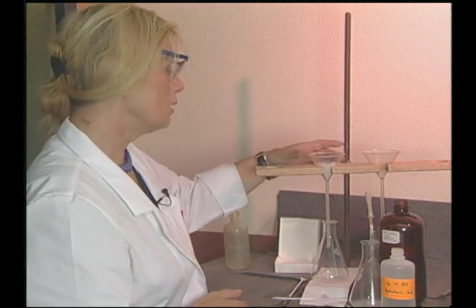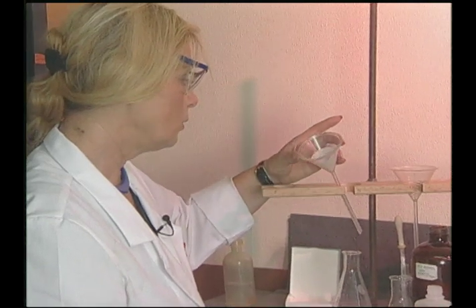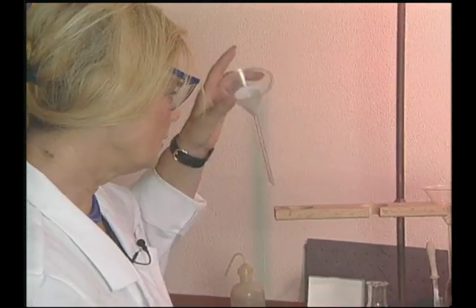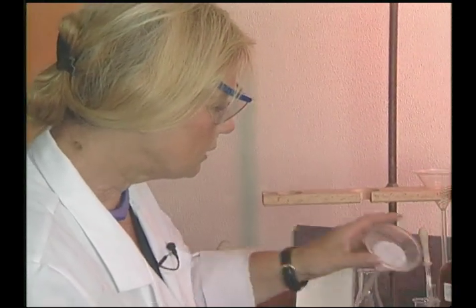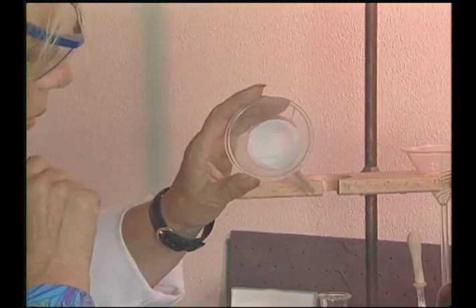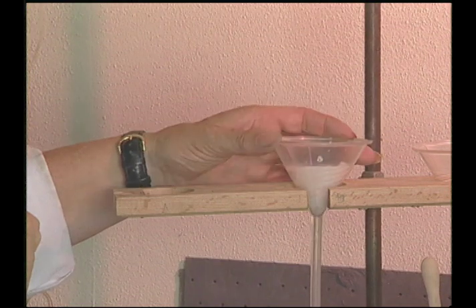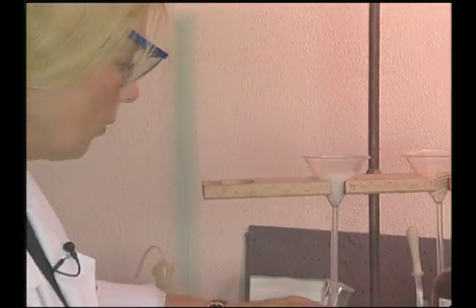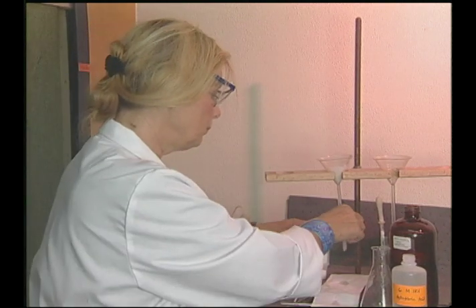And I'm going to take a look and see how dry the residue is. I'm going to cheat a little bit so you can see it. You can see the crystals here being held back by the filter paper. The solution or the filtrate should be clear, and it is, so I did a good job.